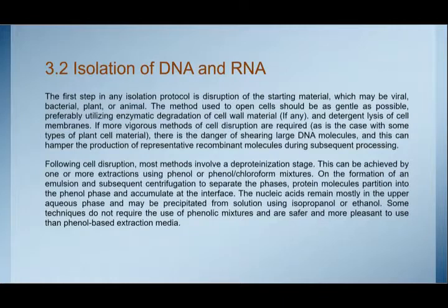Following cell disruption, most methods involve a deproteinization stage. This can be achieved by one or more extractions using phenol or phenol-chloroform mixtures. On the formation of an emulsion and subsequent centrifugation to separate the phases, protein molecules partition into the phenol phase and accumulate at the interface.